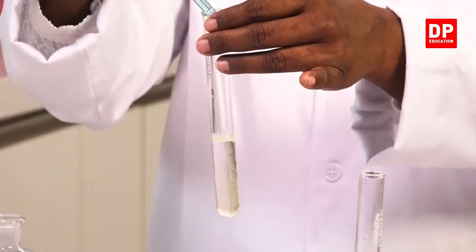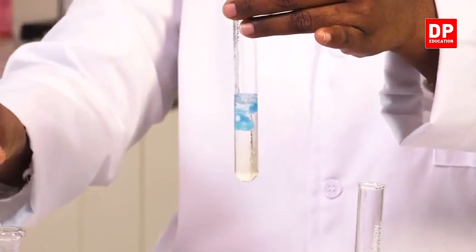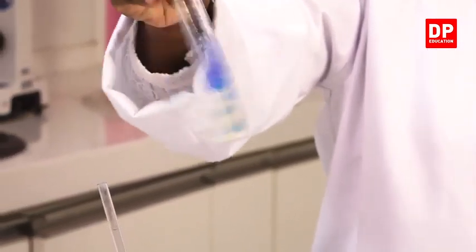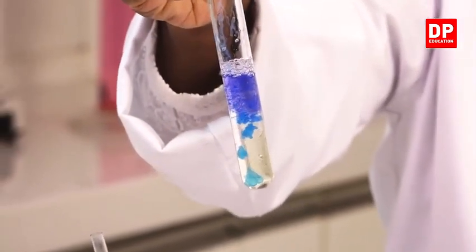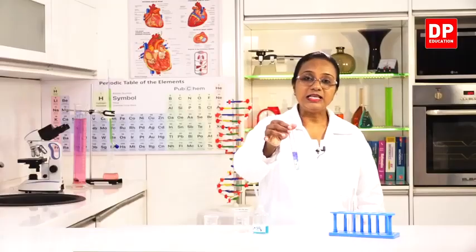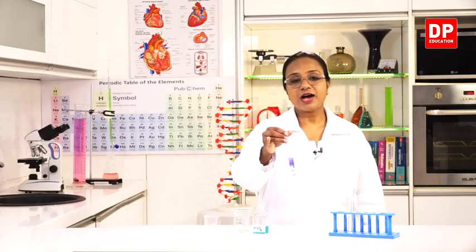To this mixture, we will add a few drops of copper sulfate. Now you can see the observation clearly. Can you all identify the color change, the observation? Yes, the appearance of purple color. This confirms the presence of protein in the sample. And you know that protein contains nitrogen as a constituent element. So therefore, we can conclude that this sample contains nitrogen in it.